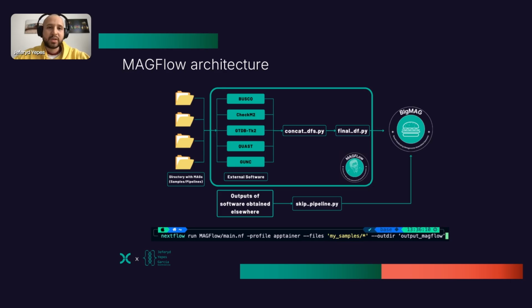And it is going to perform the taxonomical annotation with GTDB-Tk. Then, the pipeline is going to merge all of this information and create one single file that you can use for the dashboard. This is possible because the parallelism that you obtain with Nextflow allows you to obtain all of the information just to merge them, and you will get a single file for the dashboard.